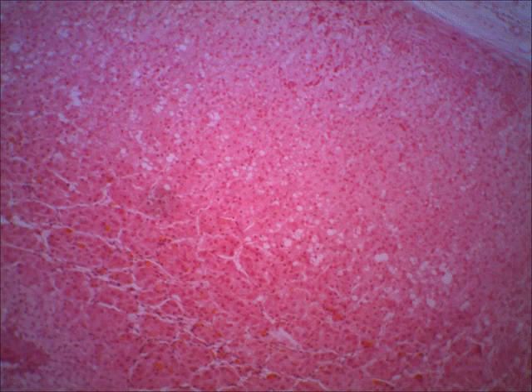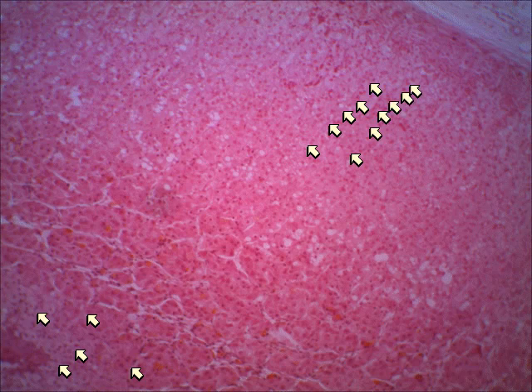On a lab test for the adrenal gland slides, I'll make sure that you can see the cortex and the medulla in the same field of view. So look for, like on this slide, what would this area be right here? This is a higher magnification now. That would be the medulla. And then the cortex would be up here. You can see how the cells are somewhat lined up. Okay, so that would be cortex.